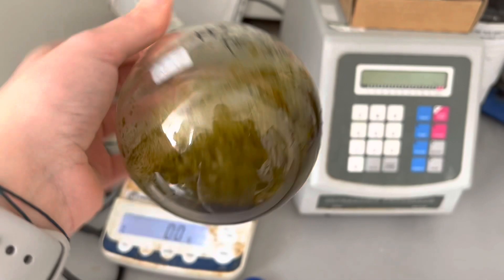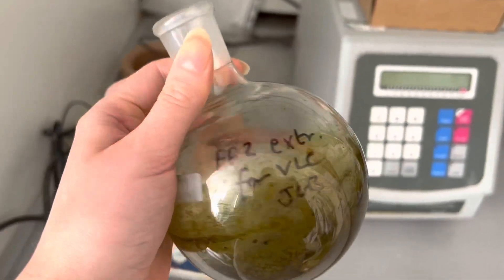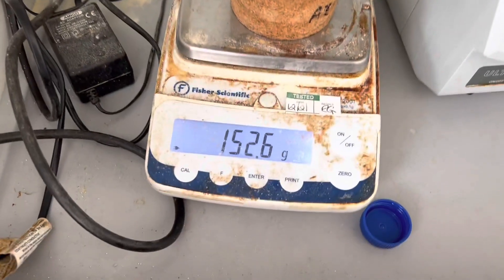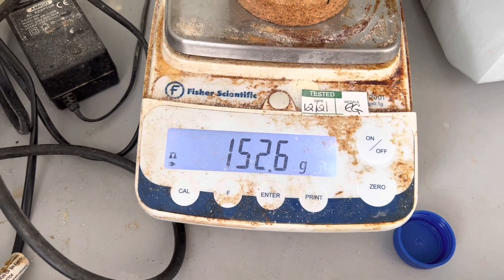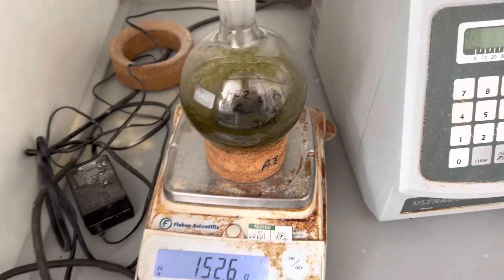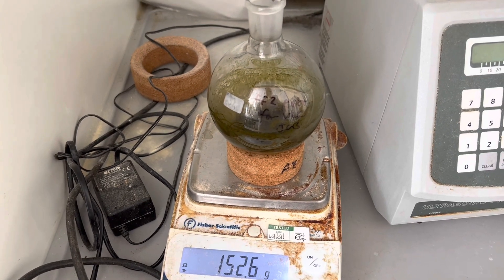Here is my sample. I dried it into the round bottom flask, which I weighed before drying, and I'm hoping it's going to be around 10 grams, but from looking at it I don't think it is. Moment of truth — I did my calculation and it's actually only four grams. You can see me reflected in the round bottom flask! So I'm going to need to add more of the liquid and dry it again on the rotovap.